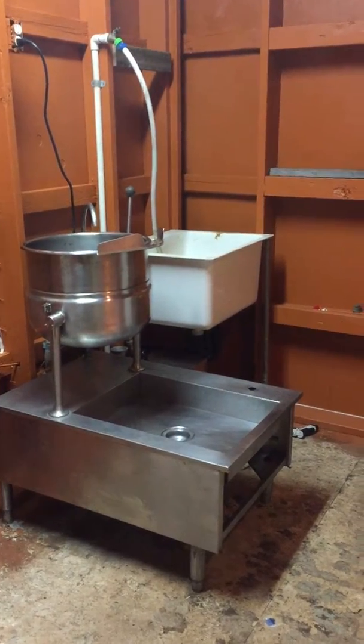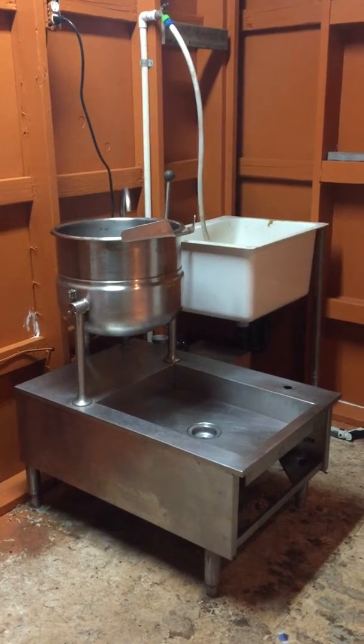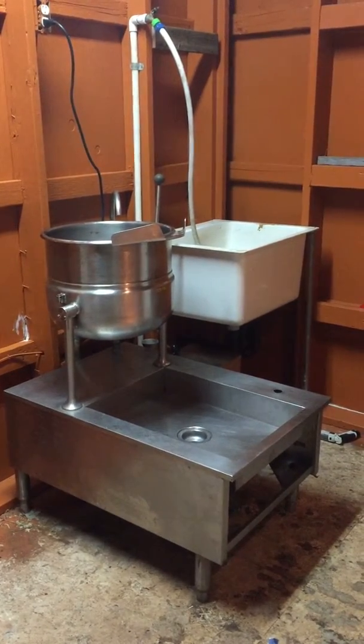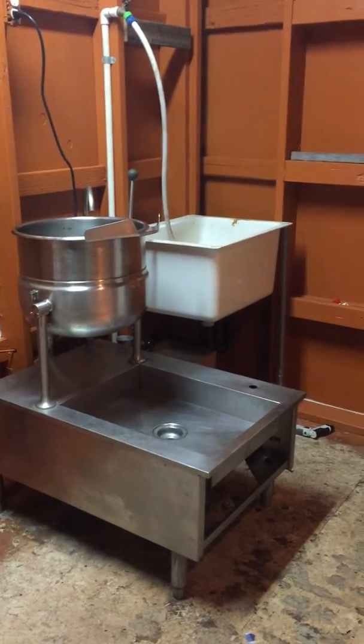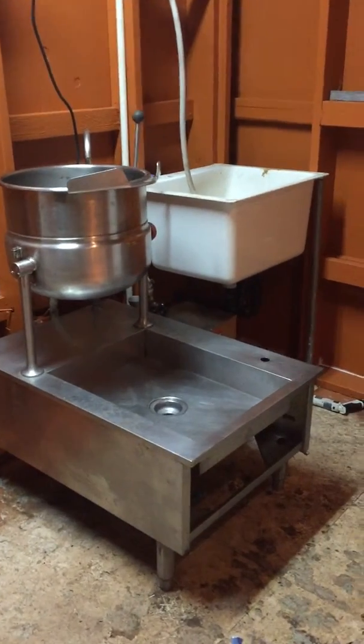Hey guys, this is Mycolab Solutions. We're setting up our lab. We did all the plumbing and water for the sink and for the kettle and also for the steamer.